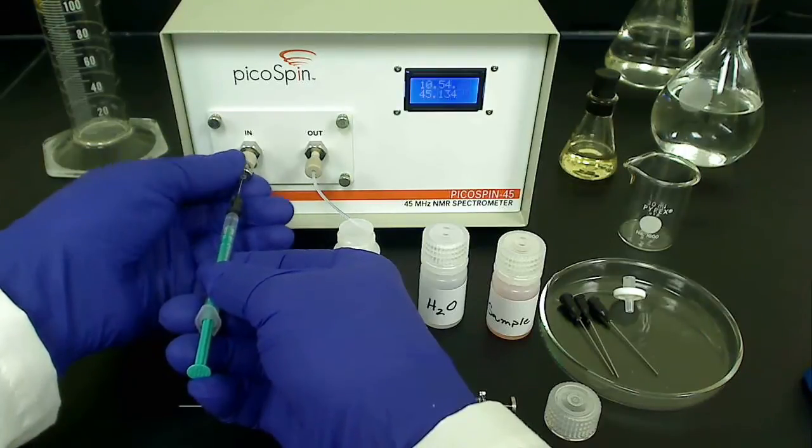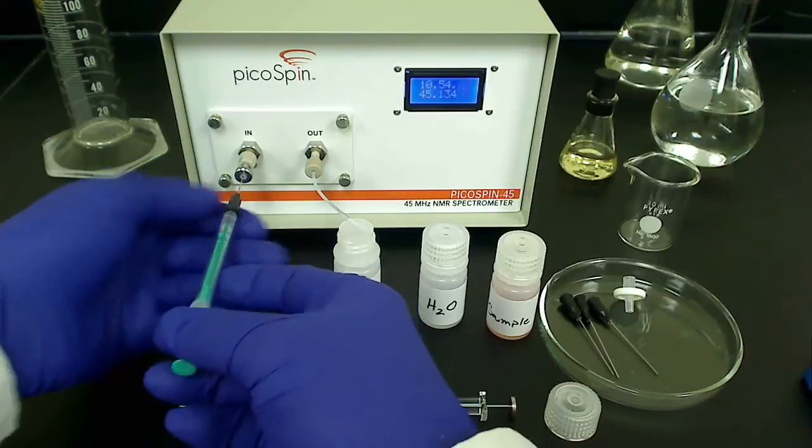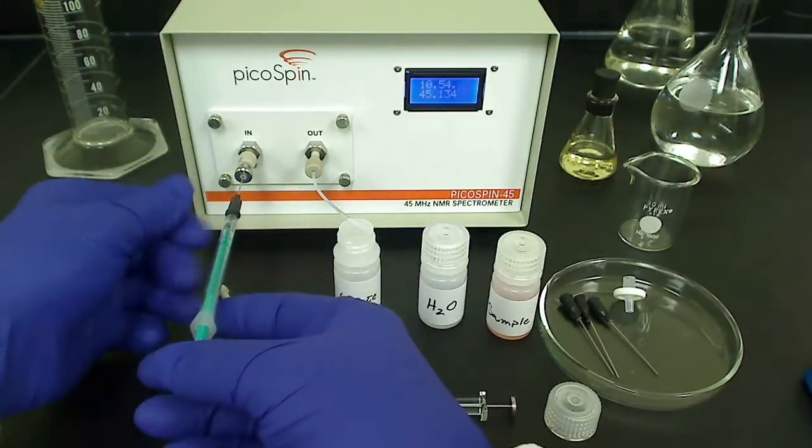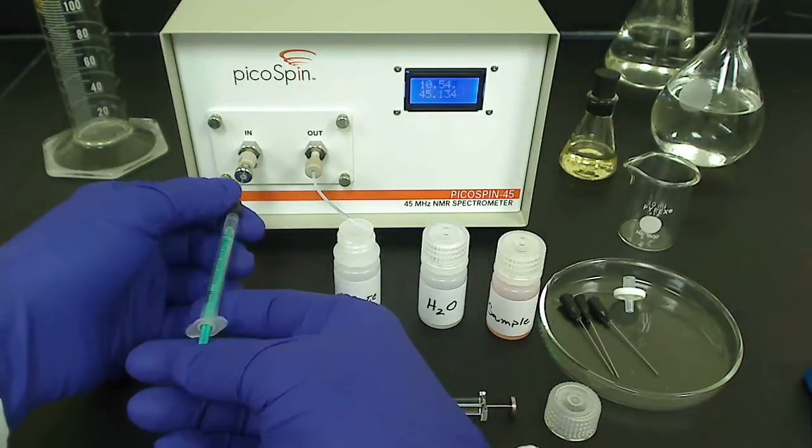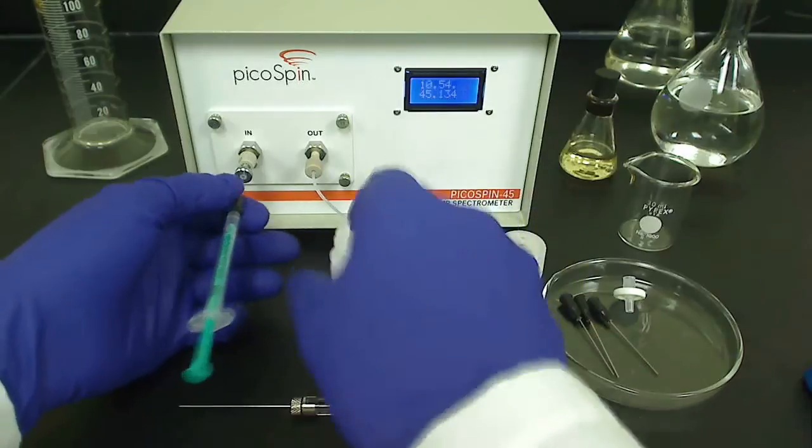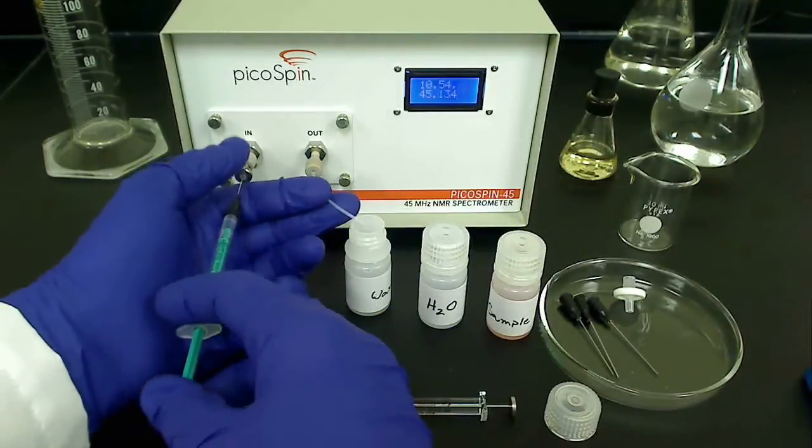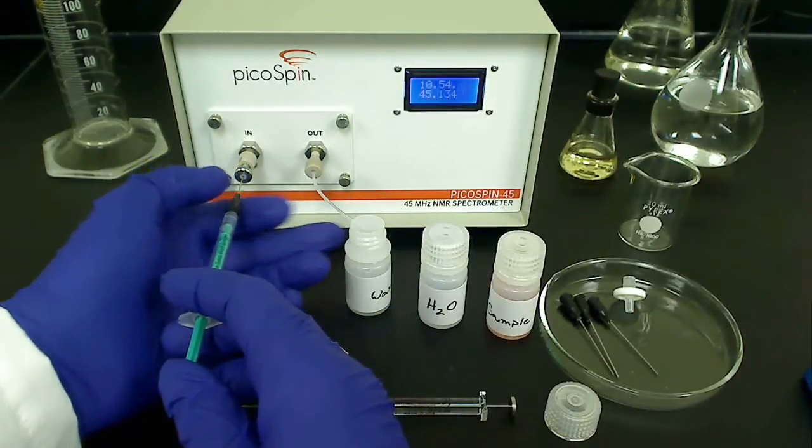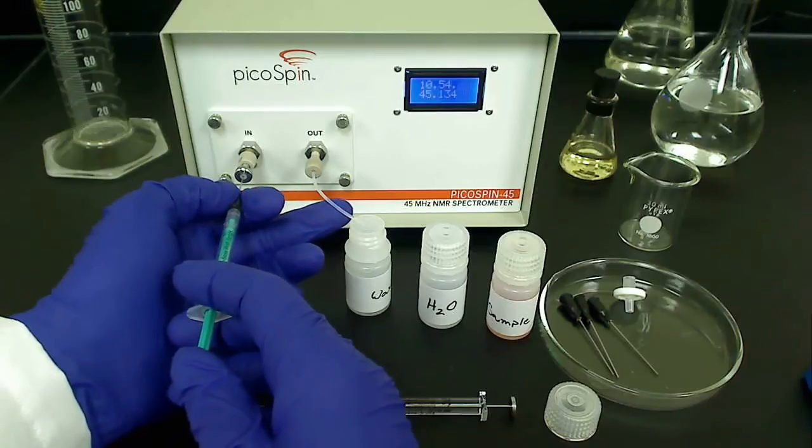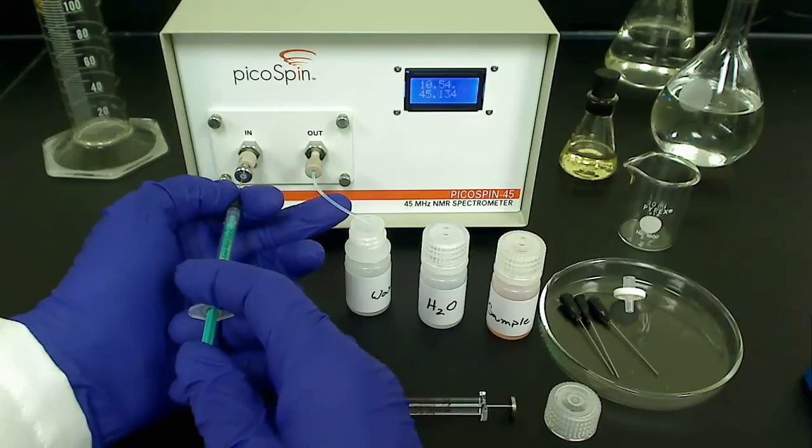Now we attach the syringe to the inlet fitting of the capillary cartridge by inserting the needle into the inline filter until we reach a hard stop. Or, if you're not using an inline filter, insert the needle directly into the inlet fitting until you reach a hard stop, and then tighten the syringe port firmly so that the needle doesn't slip out of the syringe port. This will prevent leakage as you inject your sample.